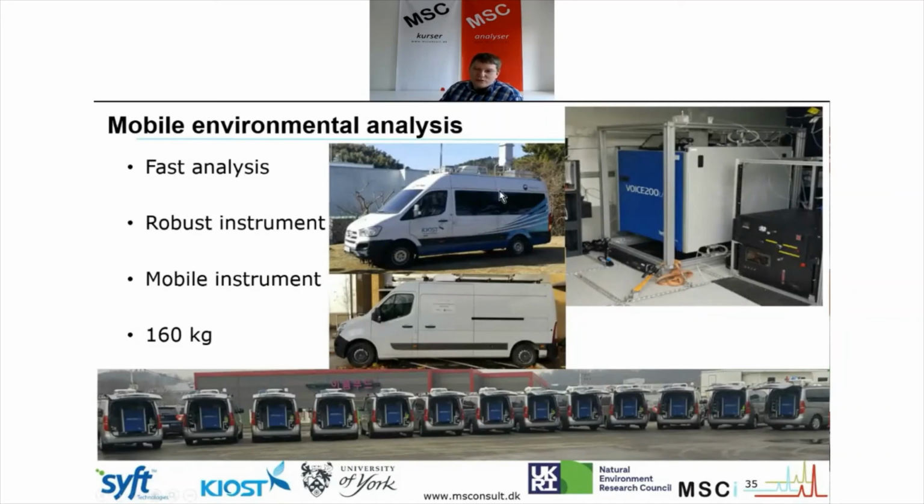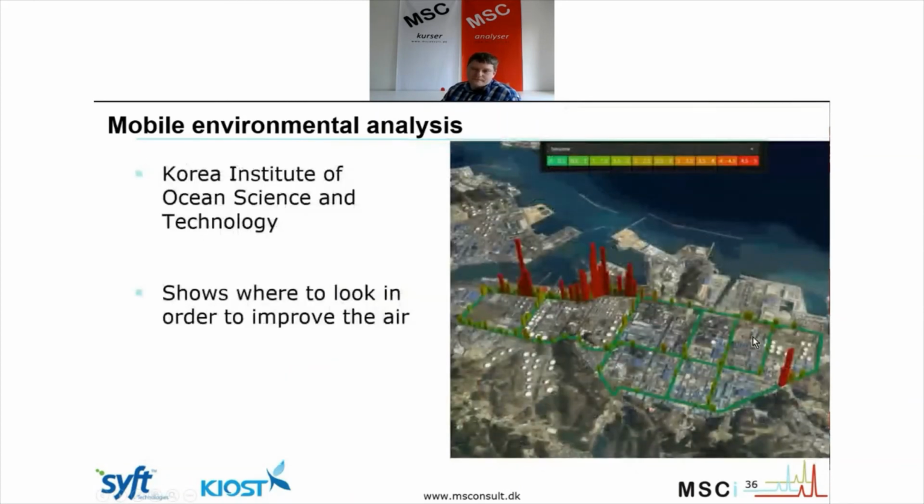They put it in a truck and put the high performance inlet outside of the truck and then do some measurements. That's possible because it is so robust and easy to handle. It's still 160 kilograms, but once you have it in the car, it actually works. So you're running a mass spectrometer while driving in a car.